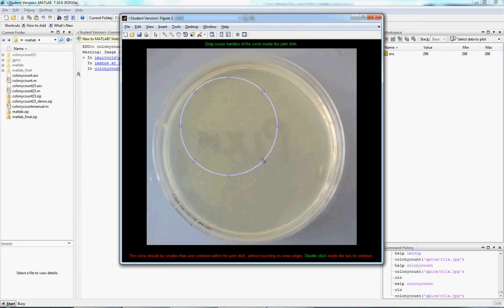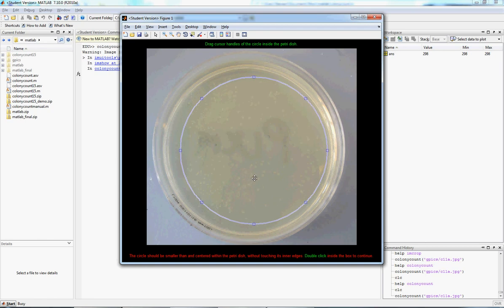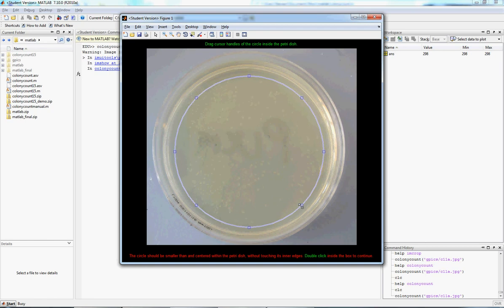So now, we have it zoomed in on the specific part, the plate that we're interested in.